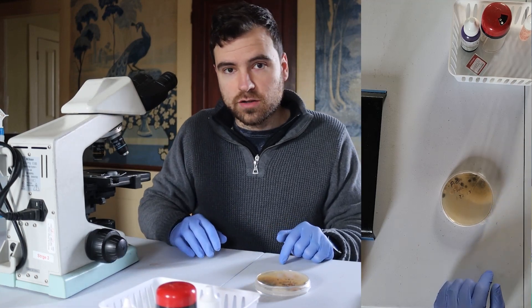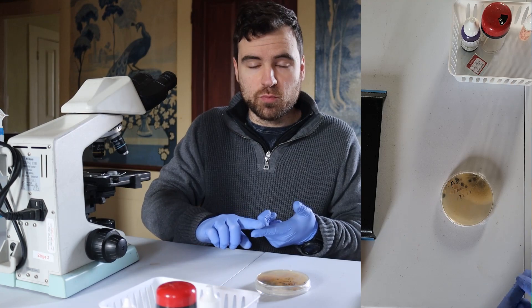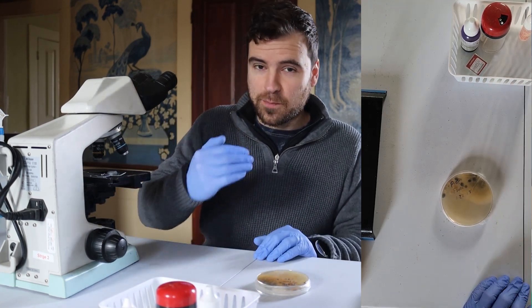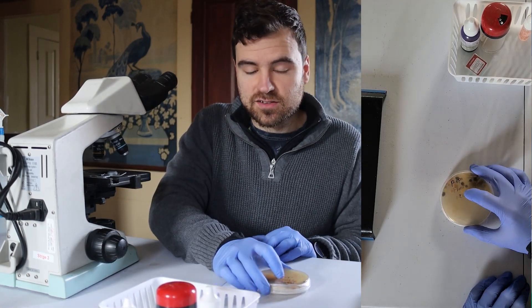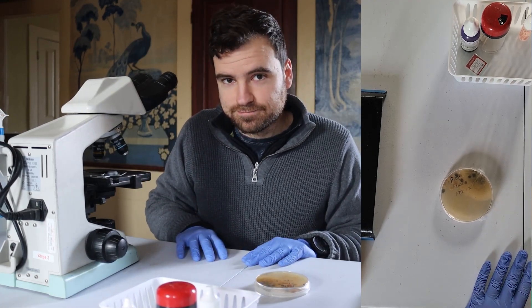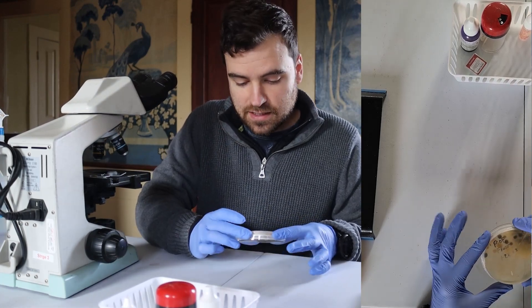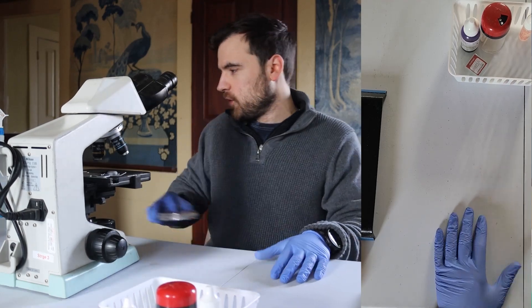You can tell a lot by a colony — its texture, color, formation, whether it's raised or flat, how deep it goes, what it looks like on the back of the plate versus the top. That can tell us a lot, and what this tells me is it's all junk. If you see this in your liquid culture, it's probably all over for you — this is heavily contaminated.